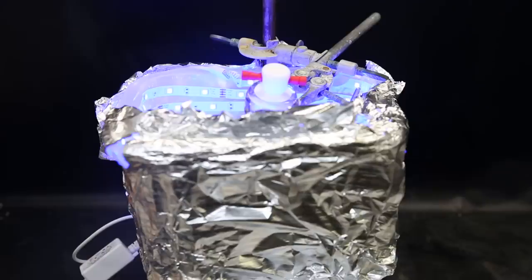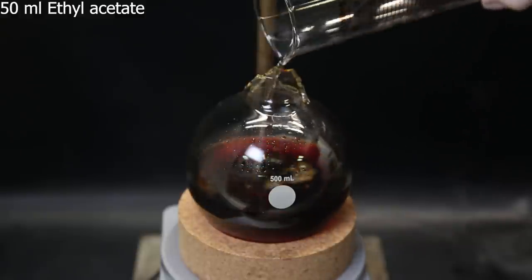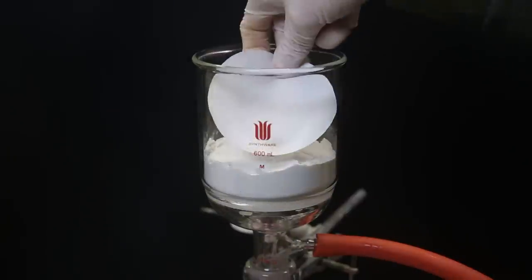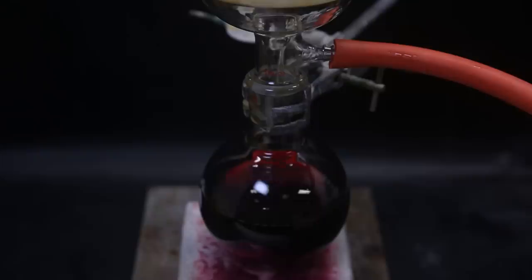When I come back, I take out the flask, and the mixture has become a bit darker. Unfortunately, the stopper was stuck, so I had to sacrifice this flask to continue. I smashed the neck with a hammer to get it open. I then dilute the mixture with 50 ml of ethyl acetate and set up a filter. I put in a layer of Celite and a paper filter on top. I then filter the mixture through and wash it with some more ethyl acetate. Pretty much nothing was left behind in the filter, so this step might not have been necessary.